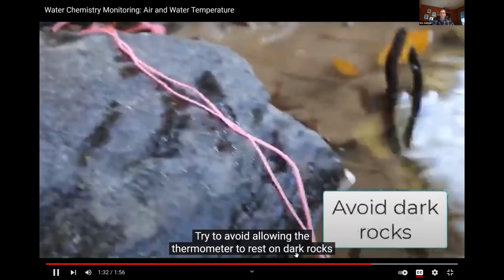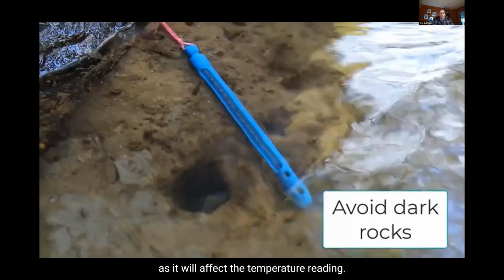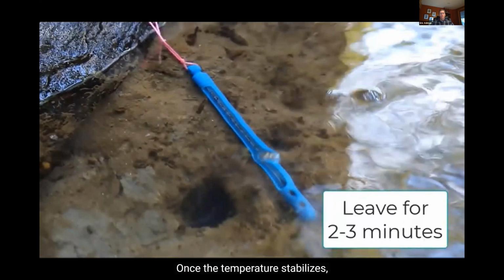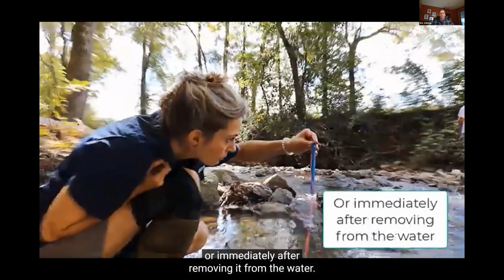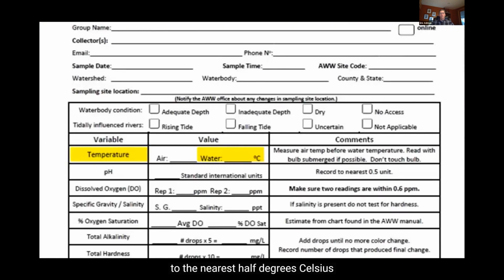Try to avoid allowing the thermometer to rest on dark rocks, as it will affect the temperature reading. Leave the thermometer in the water for 2 to 3 minutes. Once the temperature stabilizes, read the thermometer while it is still submerged or immediately after removing it from the water. Record the temperature to the nearest ½ degree Celsius on your data form.